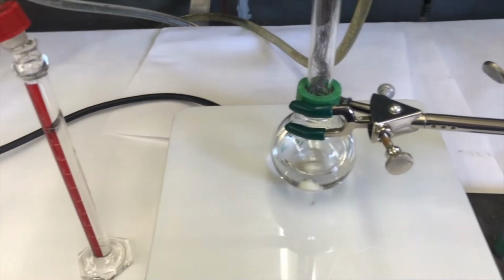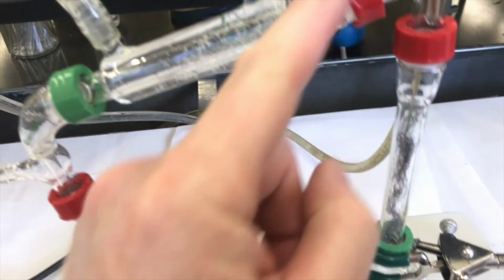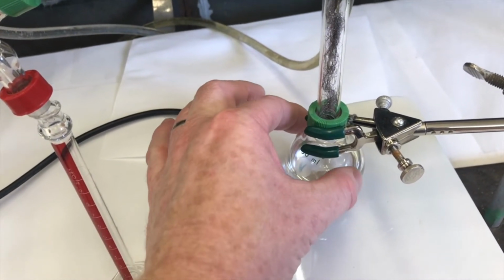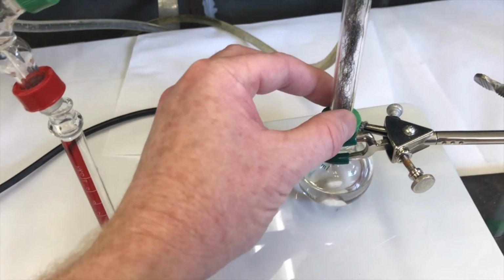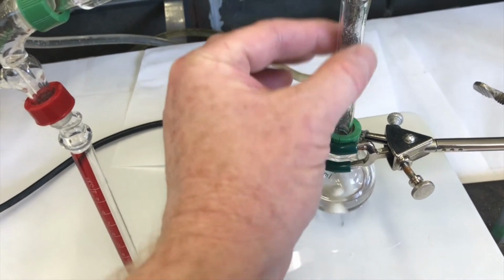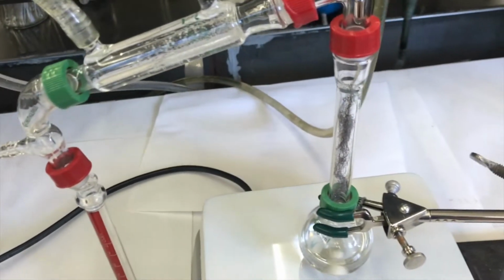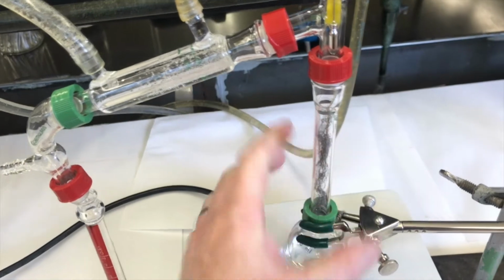As I heat this, it takes a little while to get all the way through the fractionating column into the condenser, because the solvent has to be heated, its fumes have to heat the glass of the round bottom above, then the fumes have to heat the packing and the glass air condenser. It has to heat all this, and then it can make its way over and start condensing. So to speed that up, I'm going to wrap paper towel around this. So we won't be able to see it.